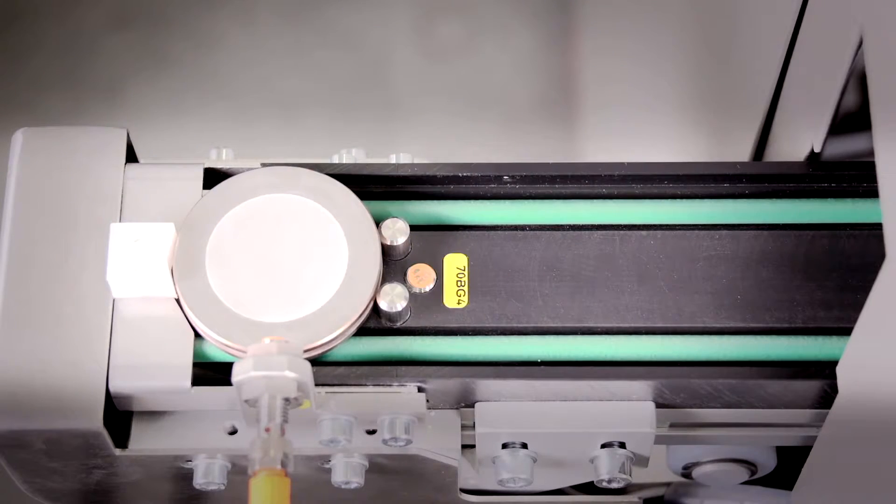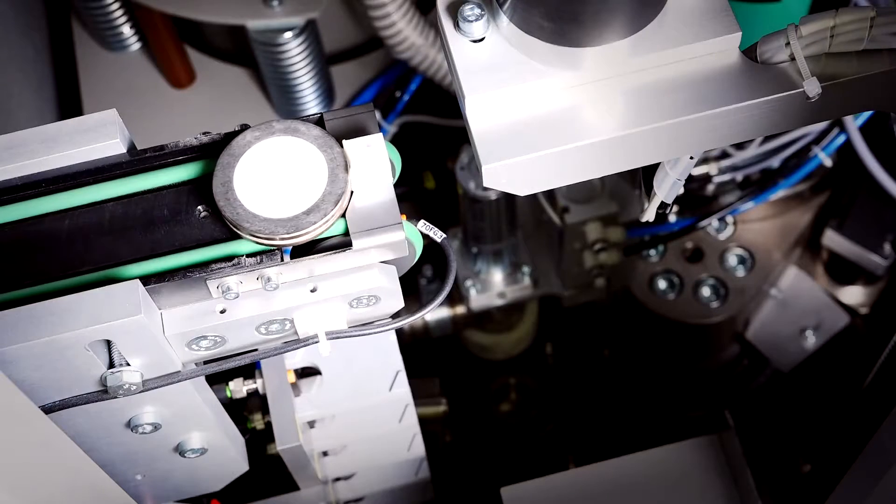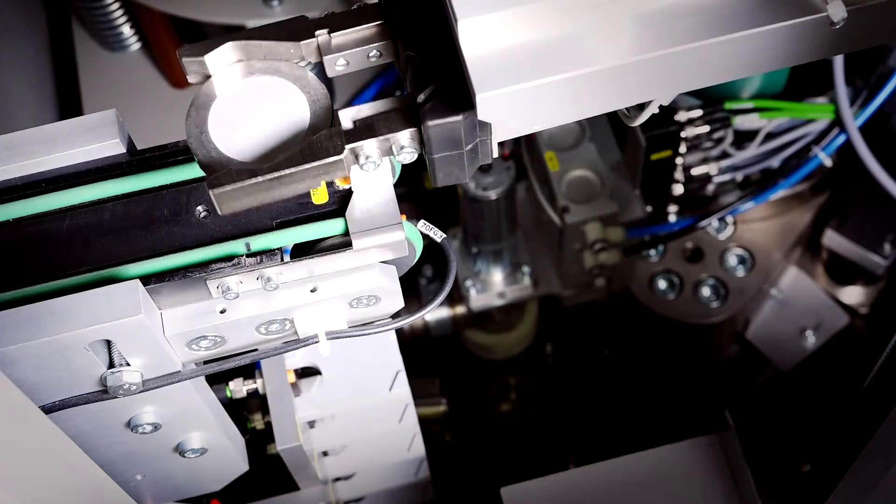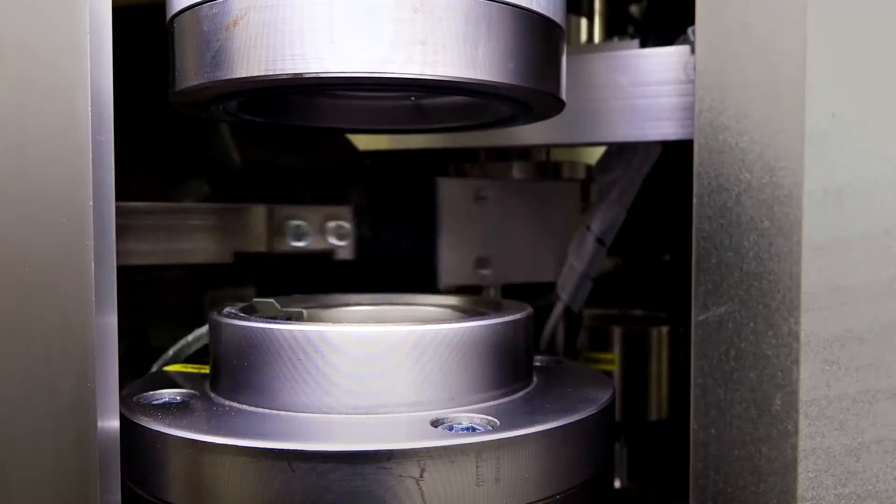The general handling axis will put the prepared sample on one of the ring output belts. The sample can then be picked up by the operator, stored in the ring cup magazine, or automatically moved to the analyzer.